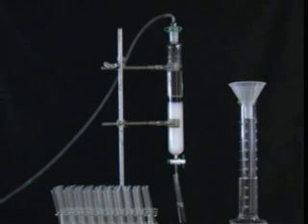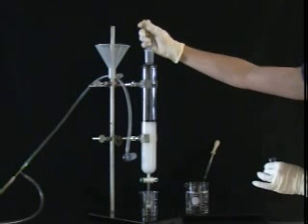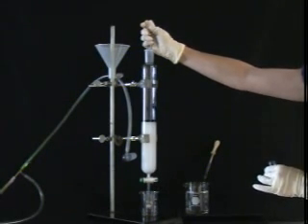As the name suggests, a column of adsorbent, either silica or alumina, is packed into a glass tube with a stopcock at the bottom. The sample is applied to the top of the adsorbent, and solvent is run through the column until the compound is flushed out of the bottom.